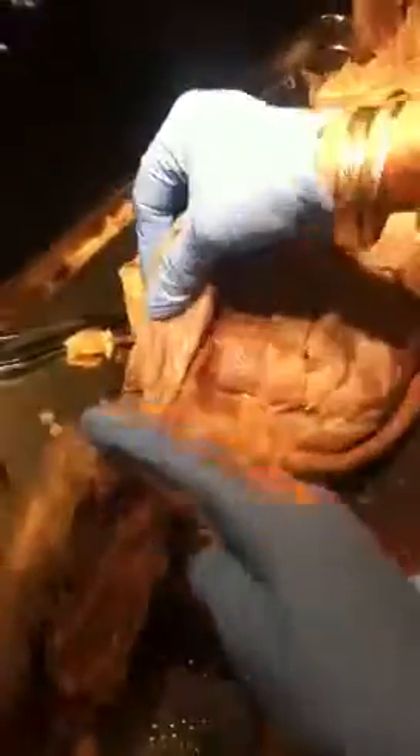Is that the rectus femoris? No, that's the sartorius. Okay, this is the whole thing reflected.